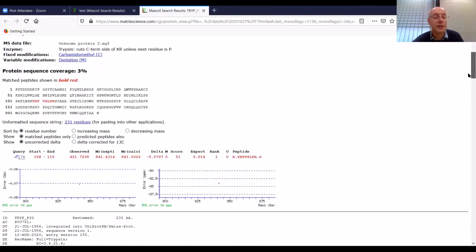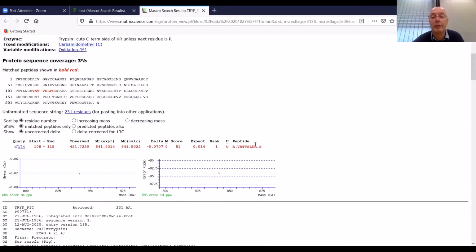the protein has a different sequence, but this peptide has the same sequence as the previous peptide I showed you. We have 8 residues, and these 8 residues in trypsin are identical to the 8 residues in the previous protein. And that's possibly the only example that exists of an 8 residue sequence which is identical to that in a protein where there is no phylogenetic relationship at all. That is purely a random match. And that's the only example of that I have ever seen.